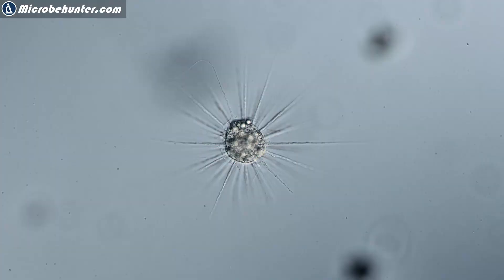This here for example is a heliozoan. It is a water organism and it does not move around very much. It's very slow moving. You can make a time lapse and see it move a little bit, but generally it is mostly static. In this case, definitely take a picture.